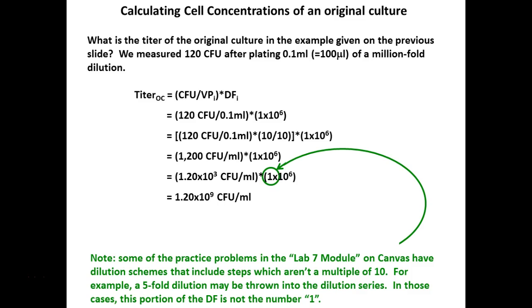Note that, as I said, in some of our dilution schemes in that packet that I gave you, this number isn't 1. It's some other number, some other factor. It isn't just to the power of 10. So make sure that you keep track of your numbers.